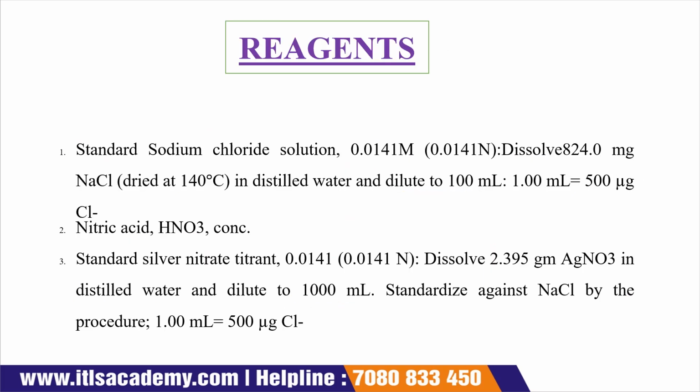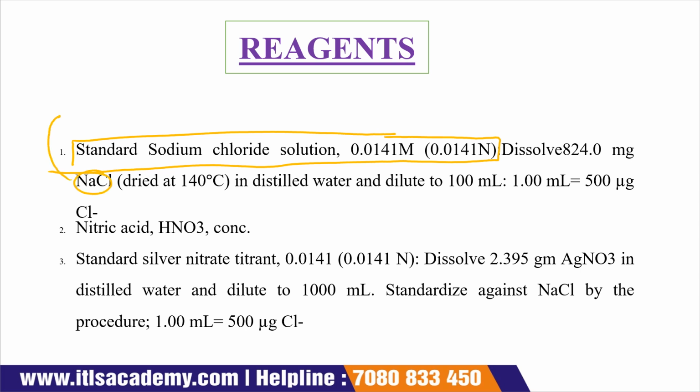The reagent that we require first is a standard sodium chloride solution, with a molarity of 0.014 molar. For that, first of all, we require sodium chloride which has been dried at 140 degrees Celsius for 2 hours. Okay, so we dissolve around 8.